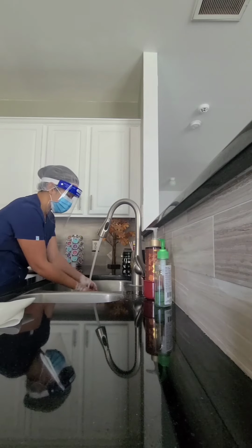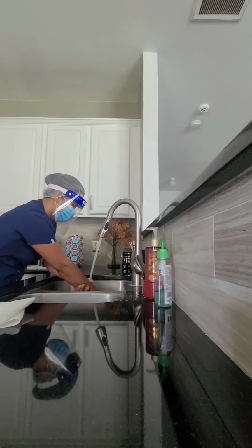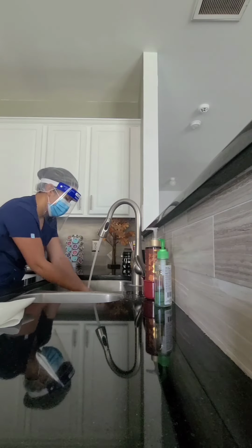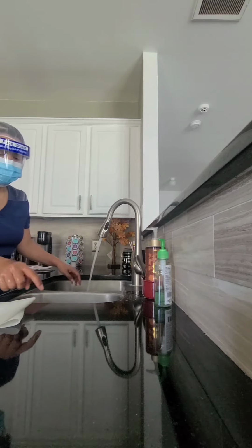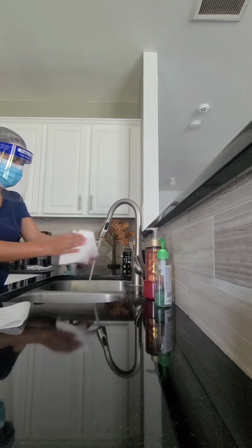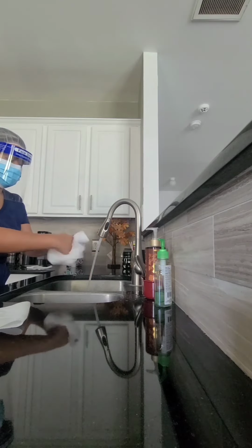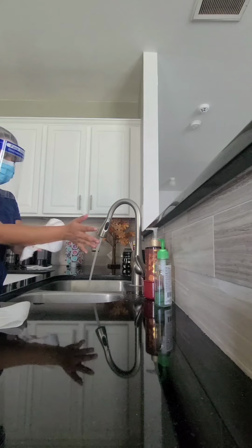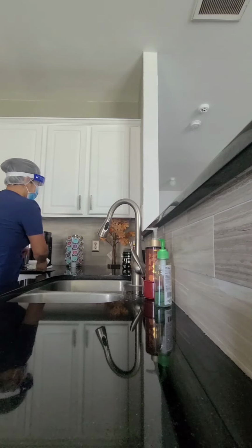I'm going to rinse my hands. And once I get the soap off of my hands, I'm going to use paper towel to dry my hands. And I'm just going to tap dry my hands like this instead of rubbing them. Now that my hands are dry, I'm going to use another paper towel to turn off the water. And that's it. Alright, now that my hands are washed, I'm going to put on the gown.